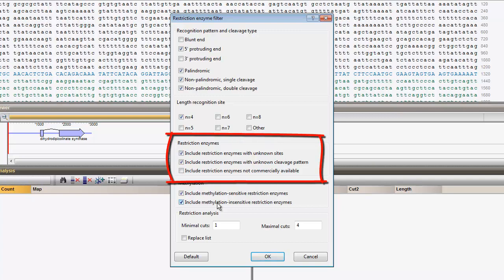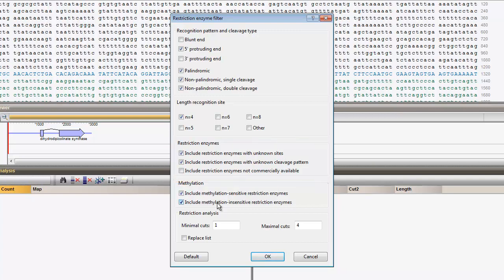Uncheck Include restriction enzymes not commercially available. And make sure all other options are checked in the restriction enzymes and methylation panels.